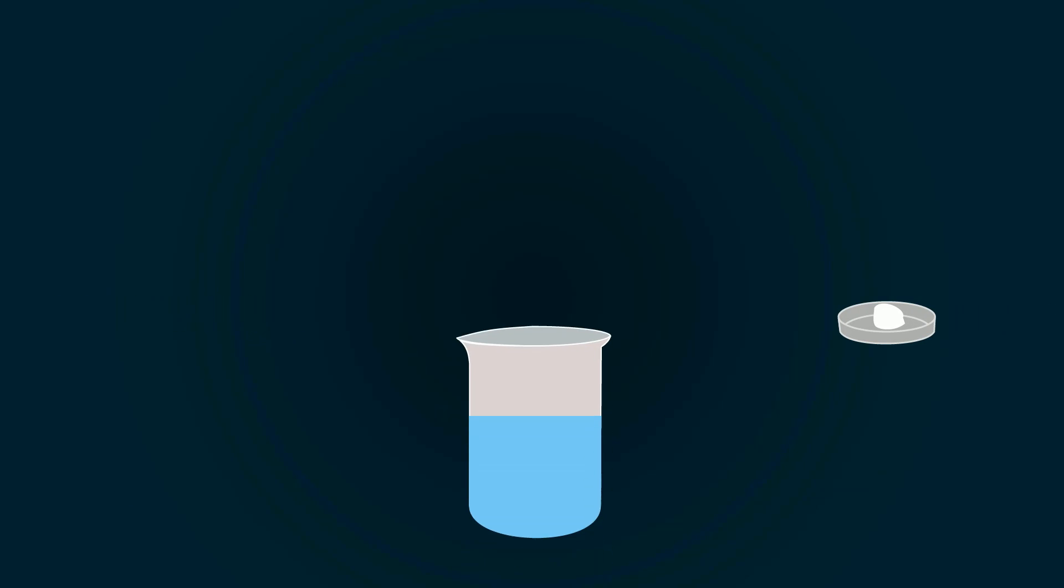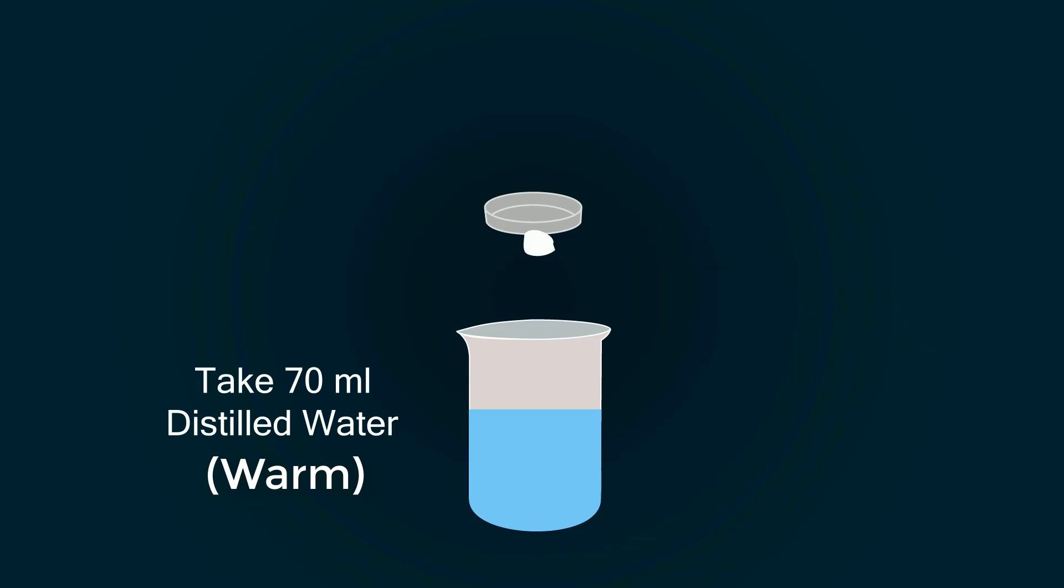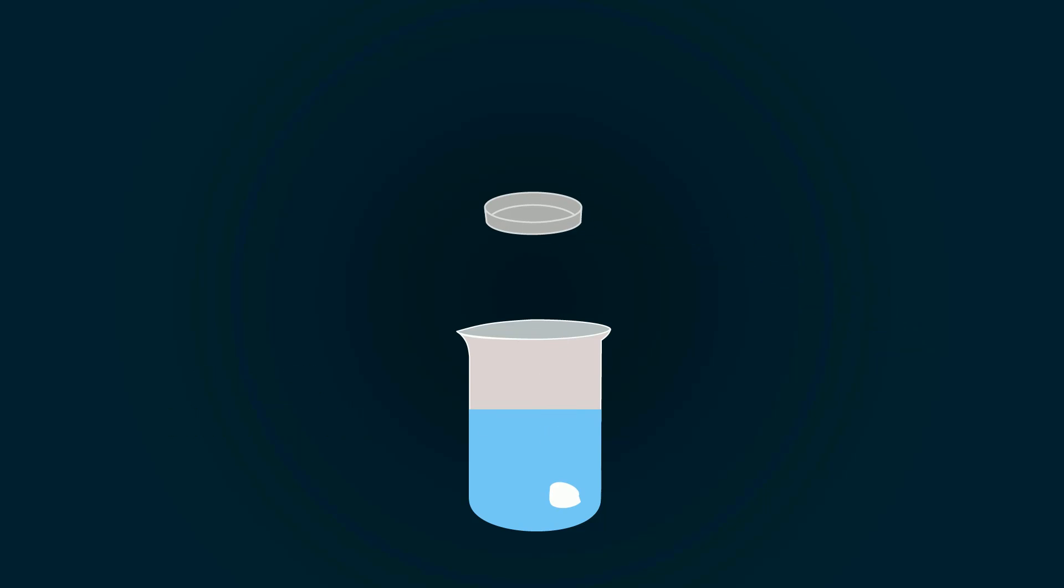Now take 70 milliliters warm distilled water into a beaker. Put sodium citrate into it.